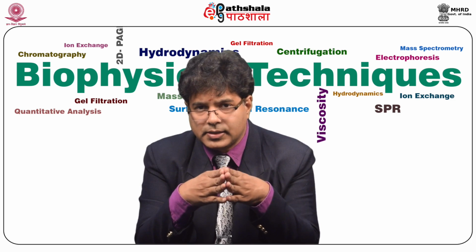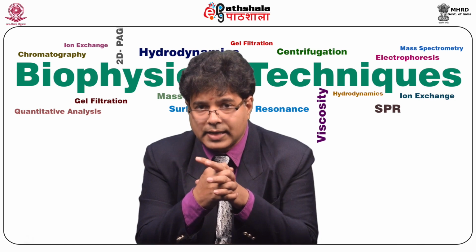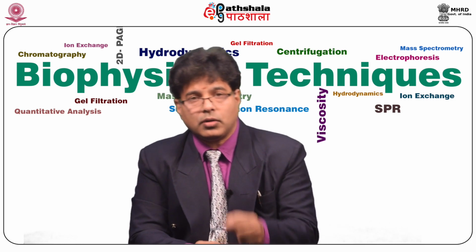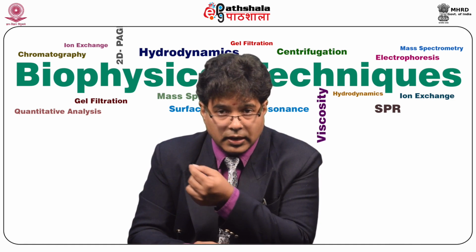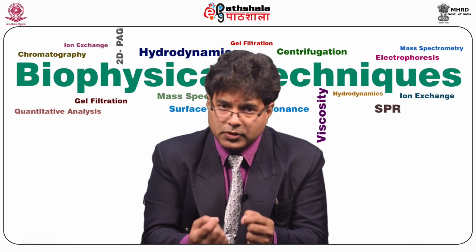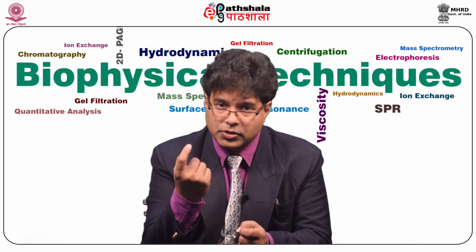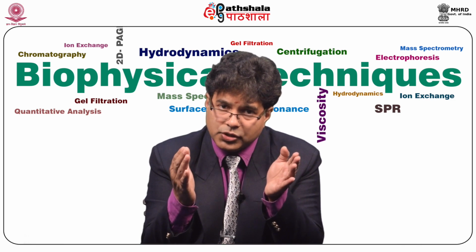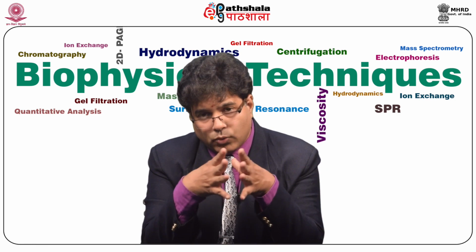The dynamic range is the property of the mass spectrometer over which a linear response is observed for an analyte as a function of analyte concentration. For example, if you quantify a compound at 2 nanograms, then 4 nanograms, 8 nanograms, 100 nanograms and 1000 nanograms, linearly you are supposed to get the response. In the mass spectrometer, the charged ion hits the detector and gives the response. This response is linear up to some range. This is the linear dynamic range, which is unique for each instrument. This allows analyte quantification.